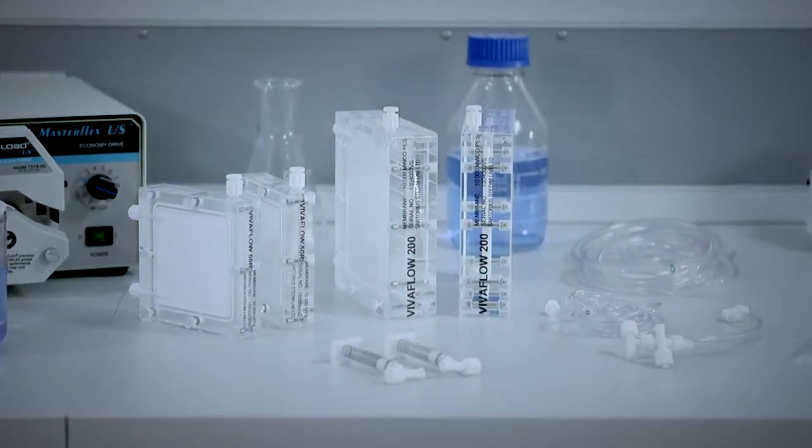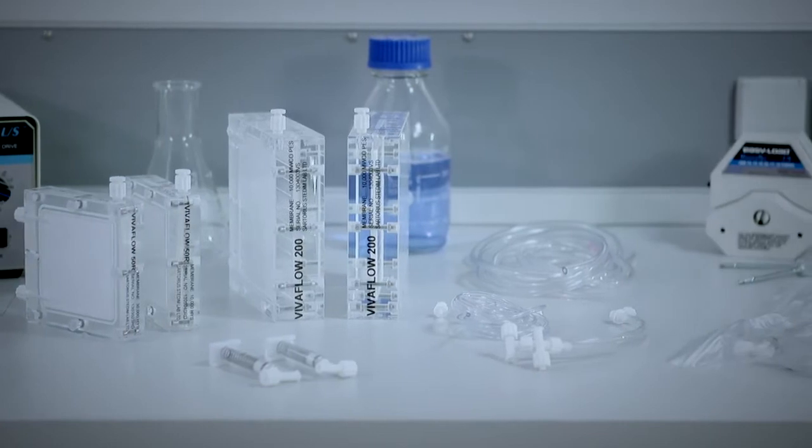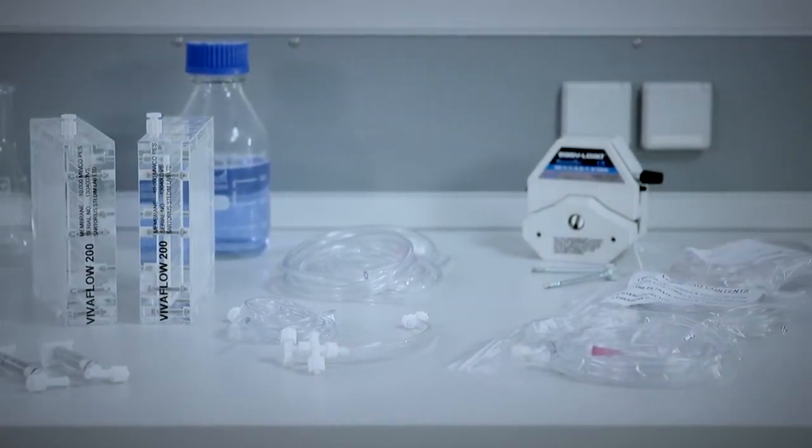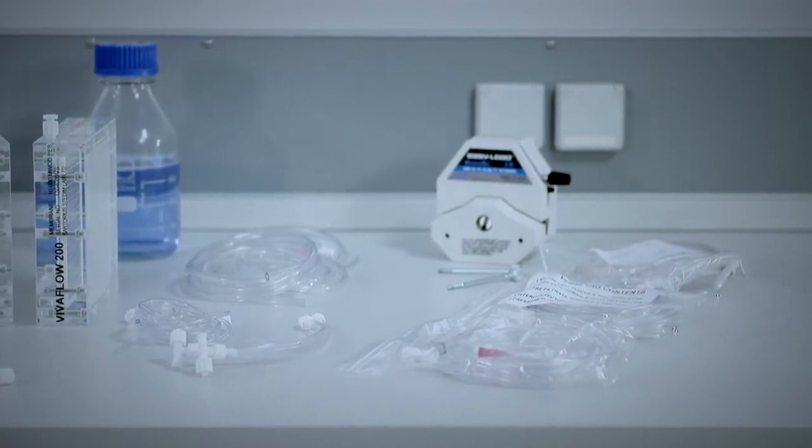The standard equipment supplied for each VivaFlow already includes filtrate tubing, a pressure indicator, and retentate tubing along with a pink color-coded flow restrictor.